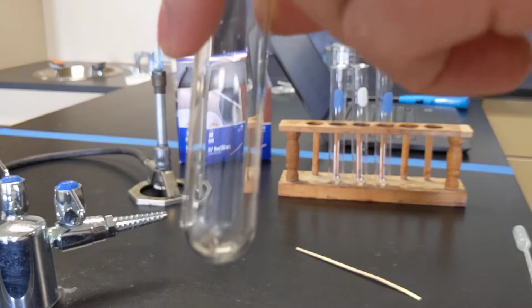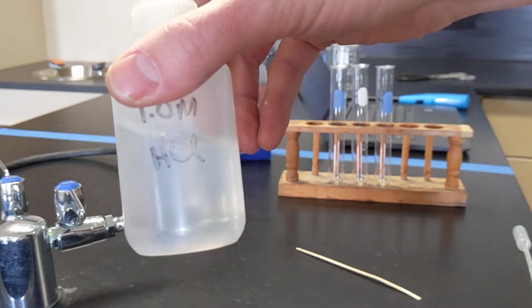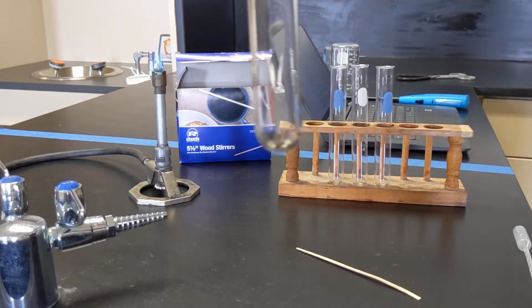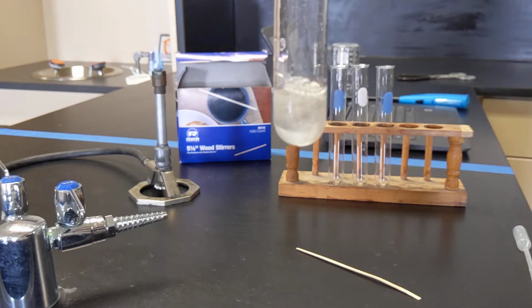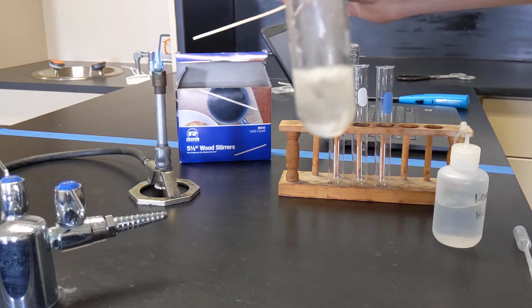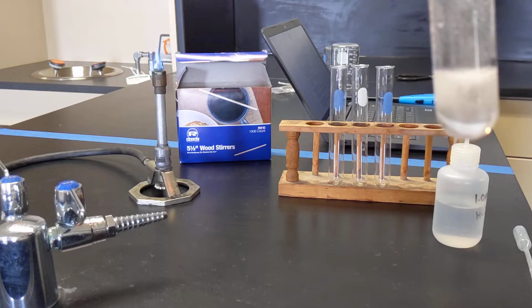I think that's in the camera. It's hard to see down there. I'm going to add the hydrochloric acid to it. HCl, 1.0 molar. I am wearing safety goggles, so don't worry about me. And then as you can see, I hope, there's a whole bunch of bubbles and fizzing going on. I'll let that do that for a while. I'm going to set my stirrer on fire.